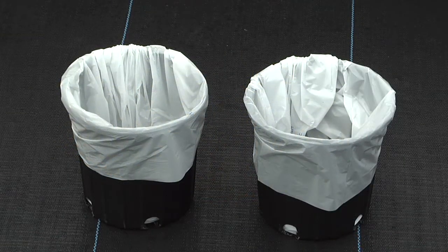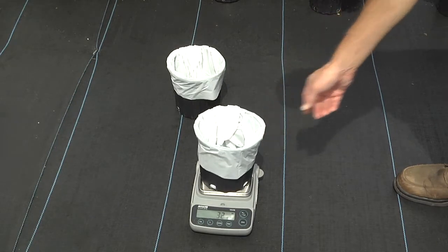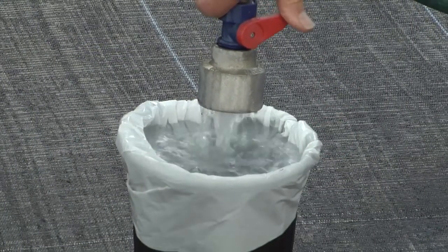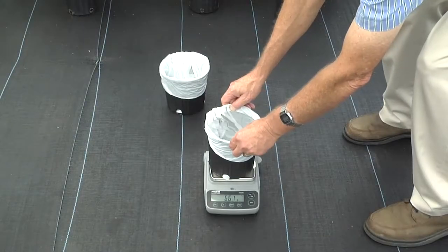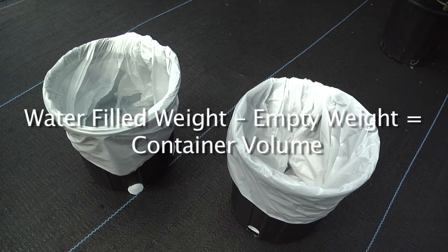Select 3-5 empty containers and line each of them with a plastic bag. Weigh each container to the nearest gram. Fill each container with water to the approximate substrate fill depth and weigh again. Subtract the weight of each empty container from the weight of each water-filled container and average the values. The weight of water in grams is equivalent to the average substrate volume in milliliters, because the density of water is 1 gram per milliliter.